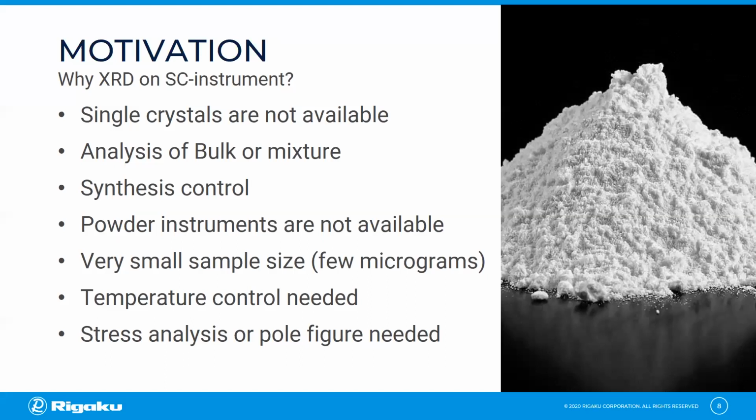While for most powder diffractometers, at least milligrams of sample are required, only micrograms are needed on a single crystal diffractometer. Most single crystal instruments are already equipped with a temperature control device, like an Oxford CryoStream, while most powder instruments are not. That comes in handy, as you can easily employ these devices for temperature experiments. Furthermore, we can analyze even materials like fibers or polymers by performing a stress analysis or pole figure measurement on a single crystal instrument, while powder instruments need special attachments in order to do so.